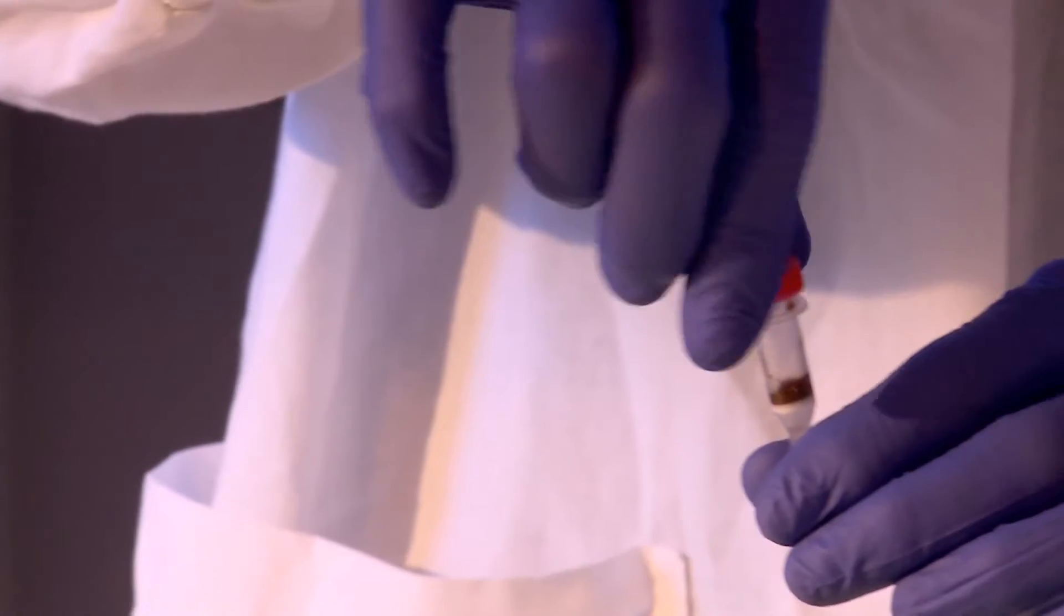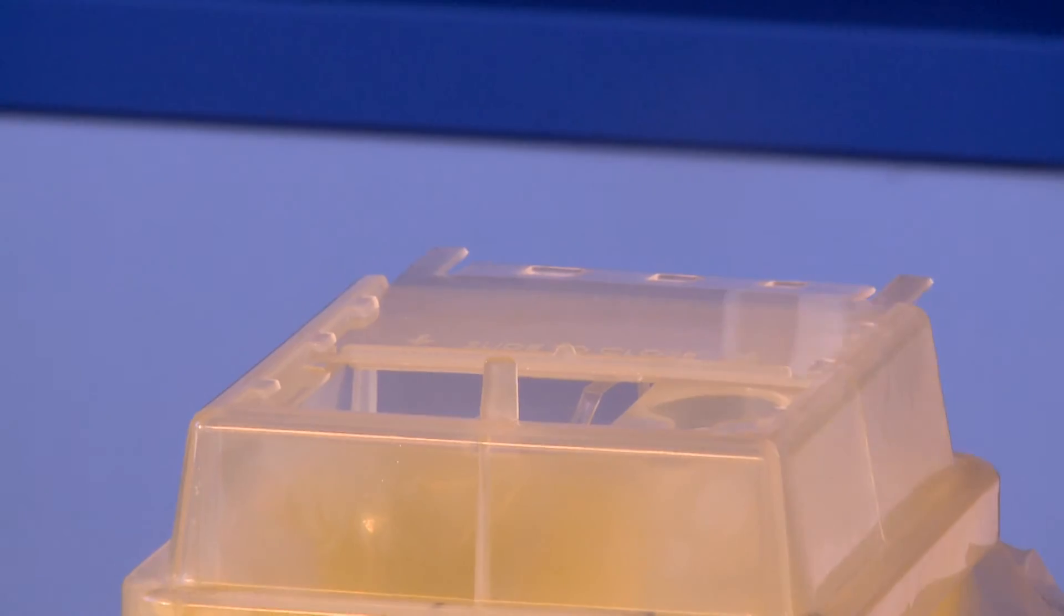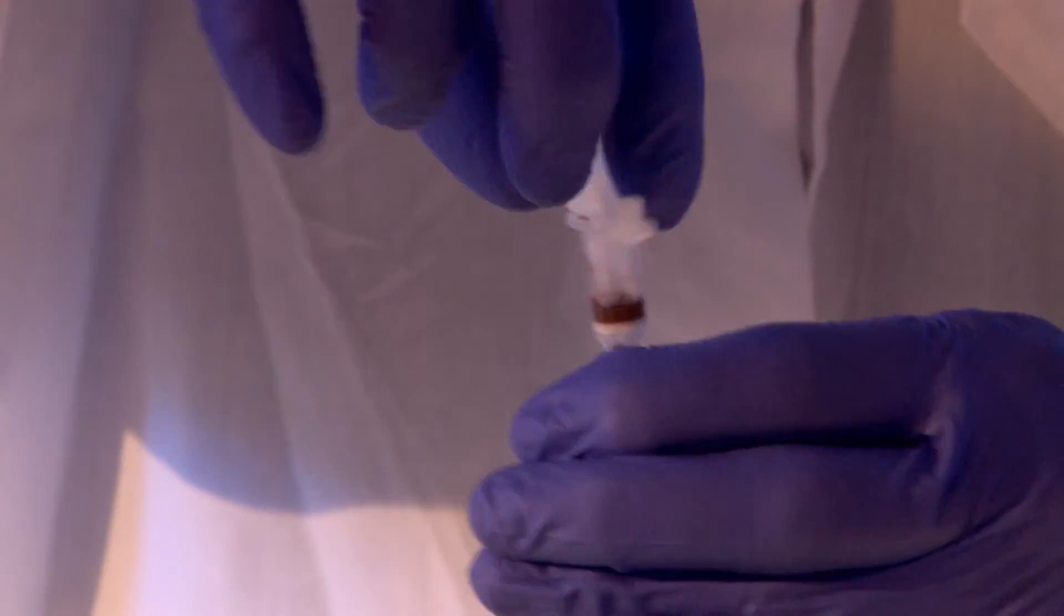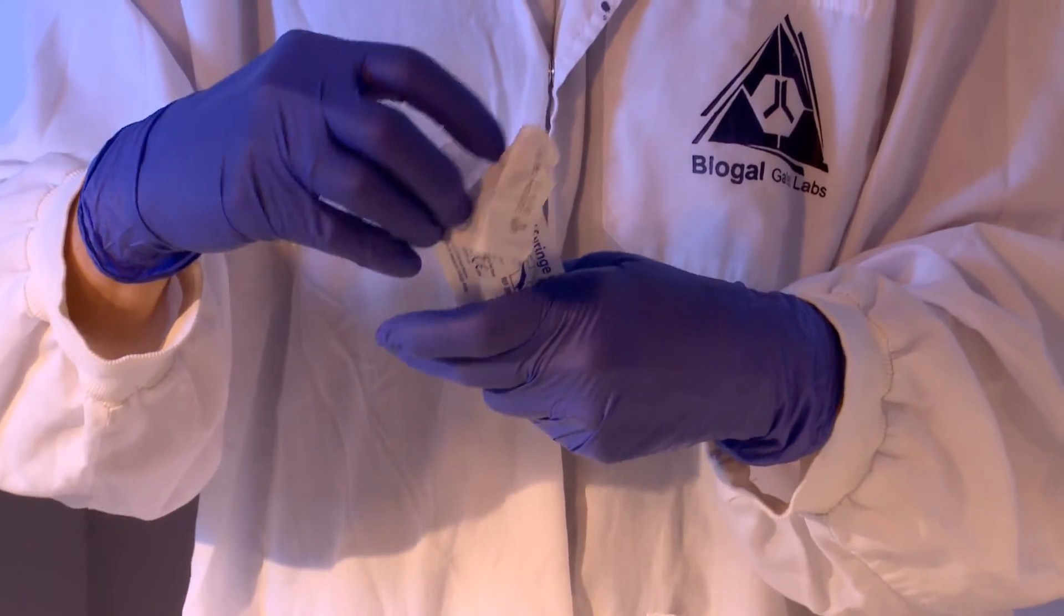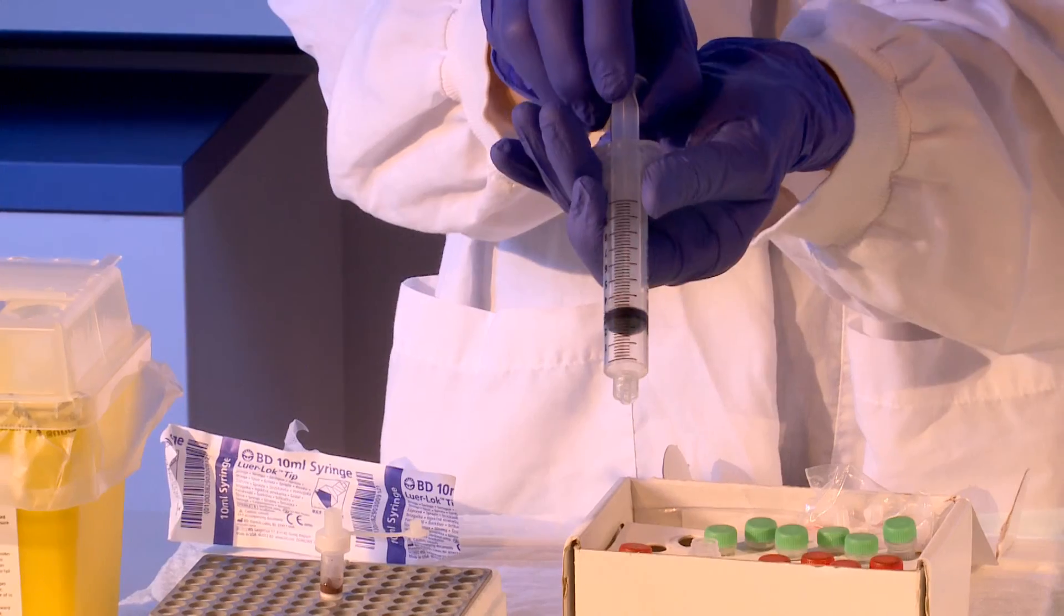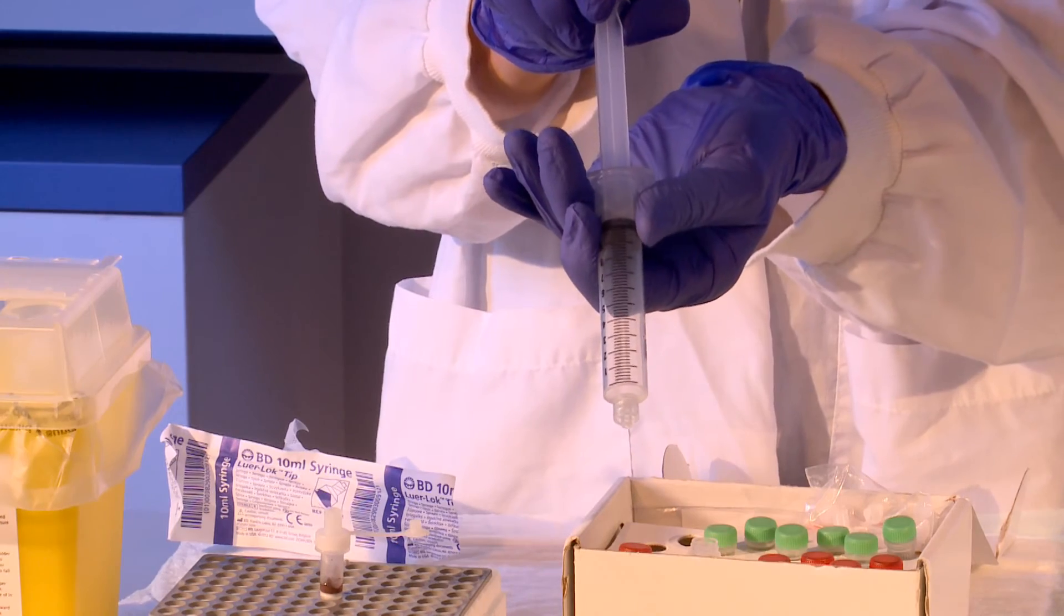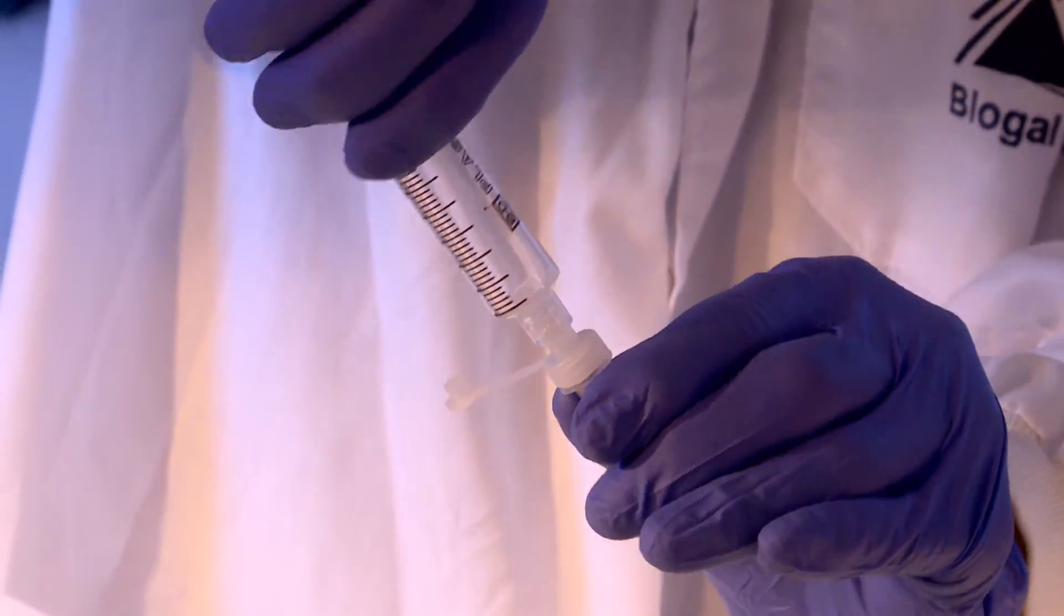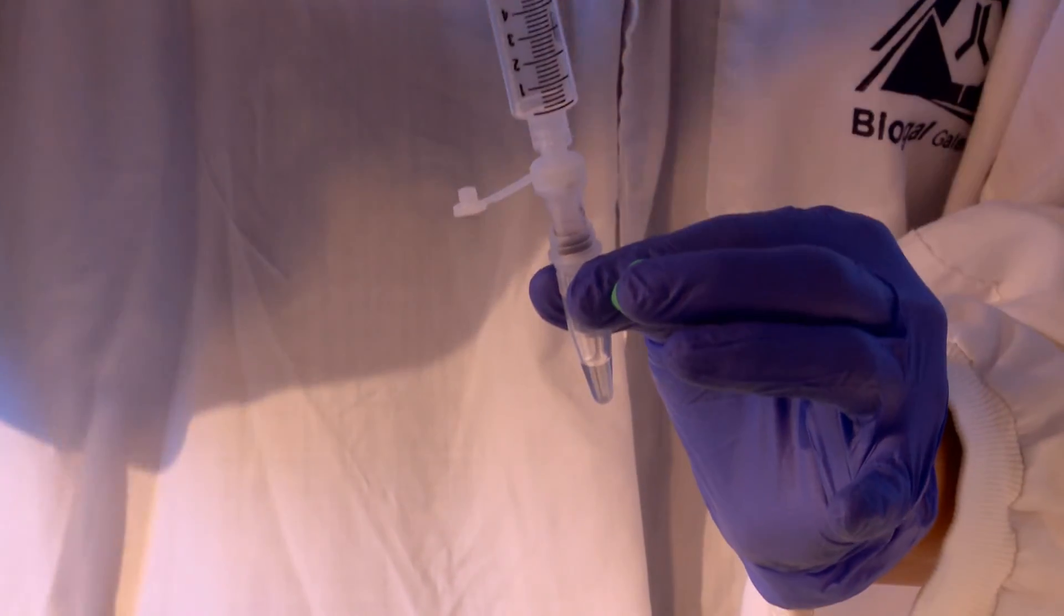Syringe method: Remove the red lid from the column and dispose of it in a biohazard bin. Firmly screw a Luer Lock lid to the column. Displace 10 milliliters of air in the syringe supplied by pulling the plunger to the 10-milliliter mark. Firmly screw the barrel of the syringe onto the Luer Lock lid.